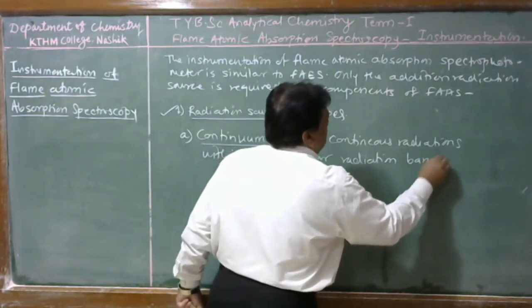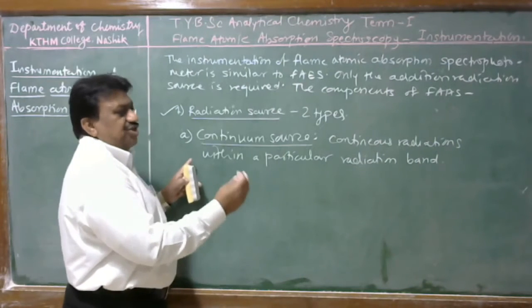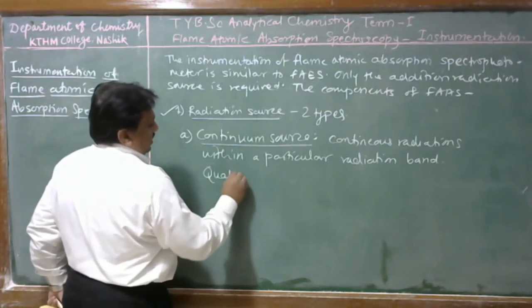That means a continuum source gives radiation in a specific region of the electromagnetic spectrum, and this source is useful for qualitative analysis.